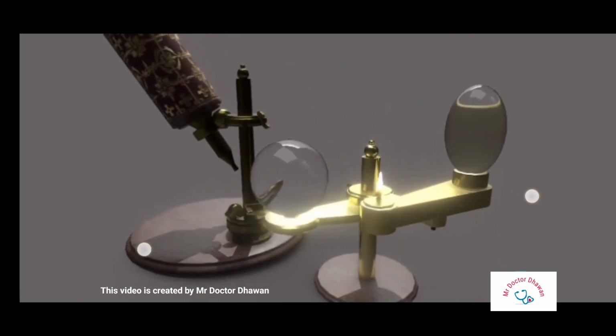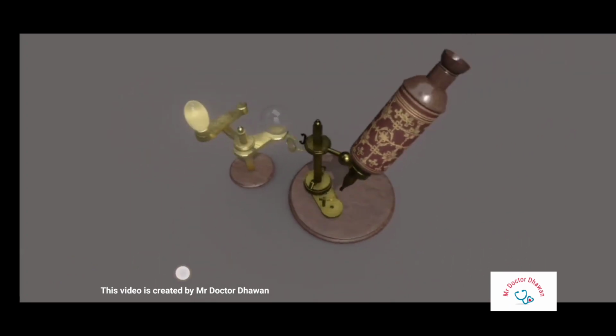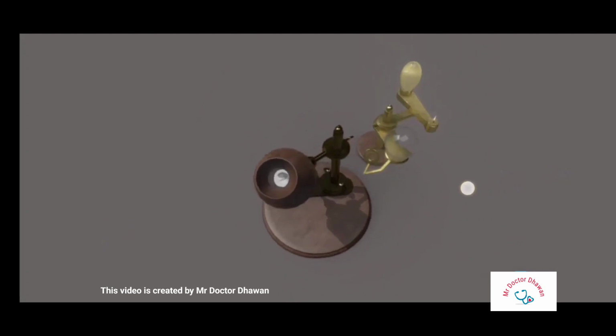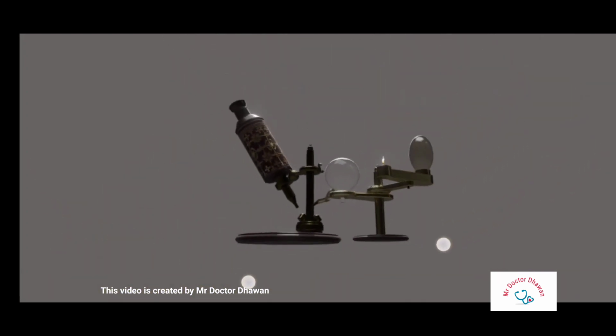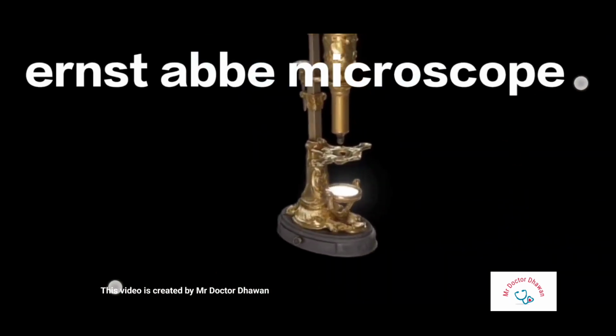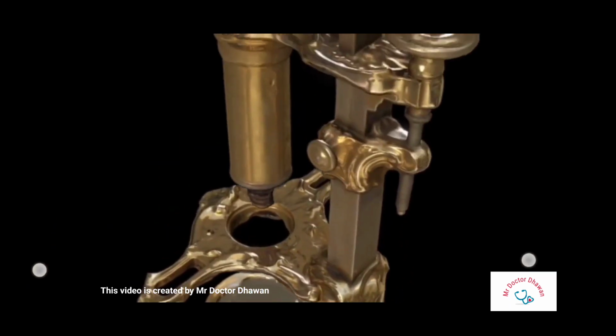Robert Hooke used a microscope to observe a thin slice of cork. The spaces he saw reminded him of the small rooms where monks lived, so he called them cells, which he used to describe the smallest units. He used microscopes with 2 and 3 lenses, but they didn't produce very detailed images.